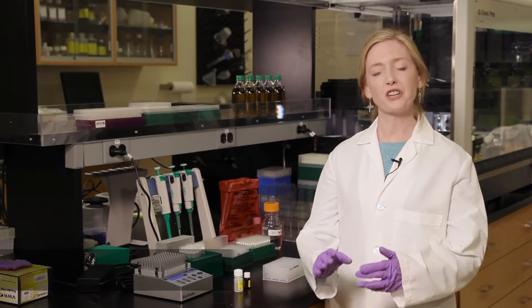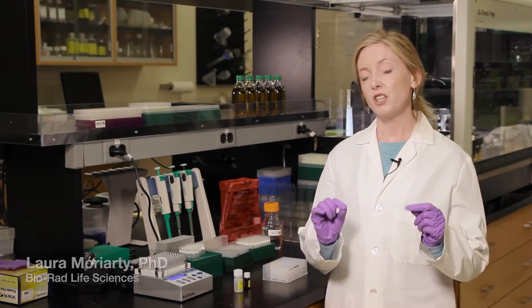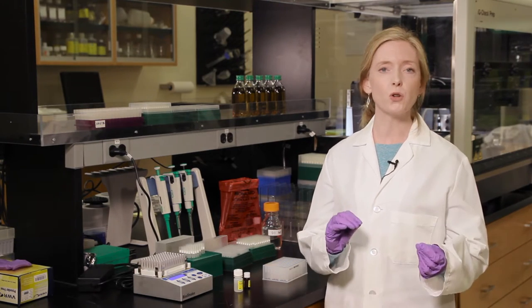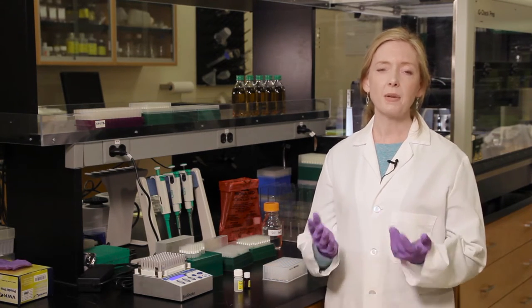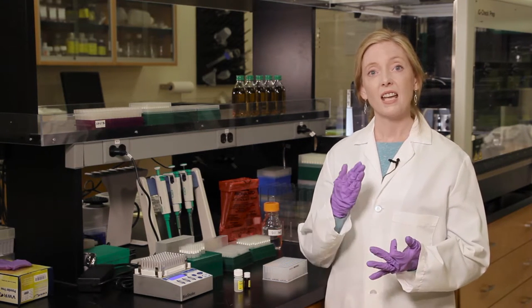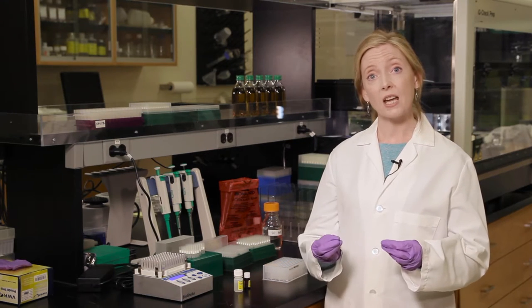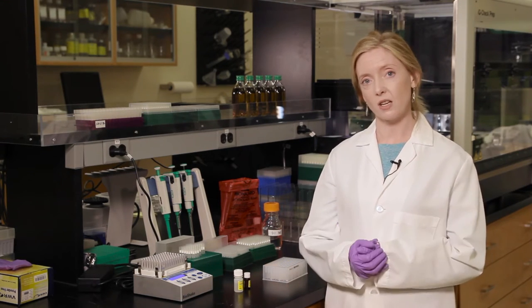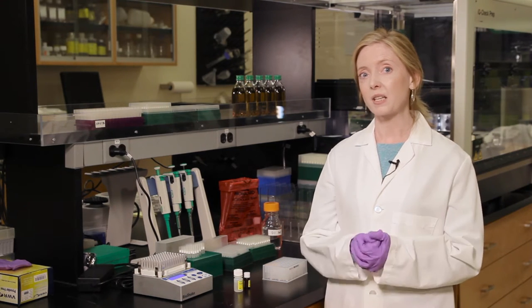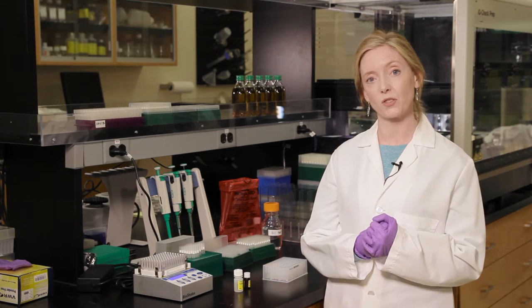Welcome to the IQCheck Free DNA Removal Solution Protocol video. Different interventions can be used to eliminate or reduce pathogens in food or in the plant environment. Some of these interventions include heat processing, sanitizers, and even bacteriophages. As a result, sometimes free DNA or even dead cells may be present in your sample, and this free DNA can actually impact molecular methods by giving positive signals when present at detectable levels.